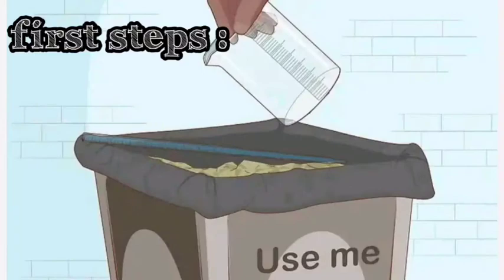Now, after you conduct the titration, I want to tell you how to finish your analysis. First, dispose of the chemicals used in a labeled waste container. Once you have completed your titration, empty out your beakers, your burette, and any other glass you used into appropriate containers. If you are unsure of where these are, ask your instructor or lab director.